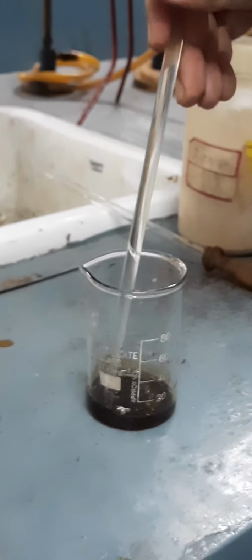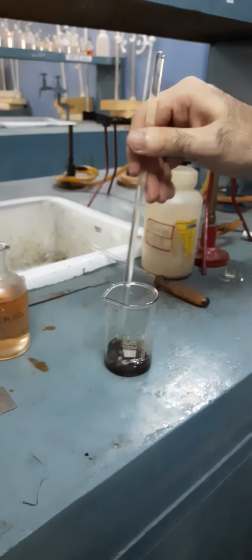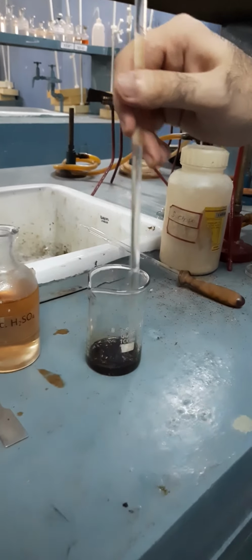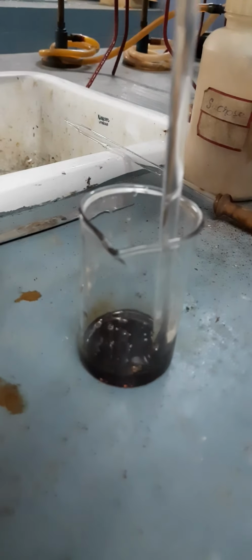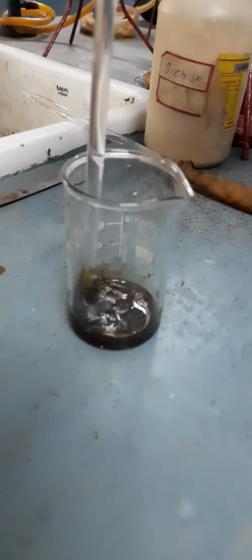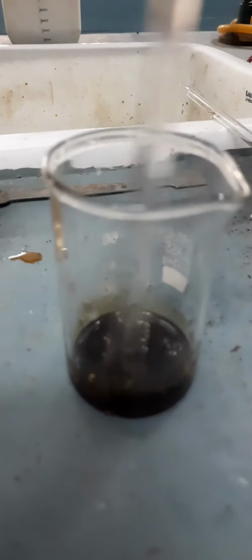Previously, the acid was almost colorless or slightly yellow in color. But now, you can see it is turning black. Now why is it turning black? Because concentrated sulfuric acid is a hygroscopic substance. Hygroscopic means it absorbs water.